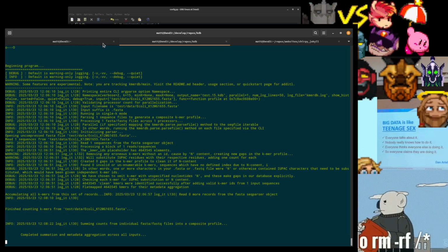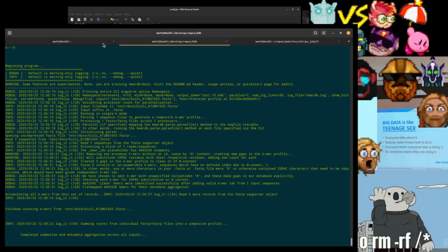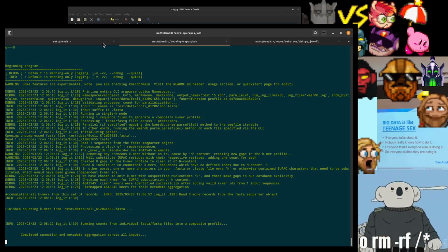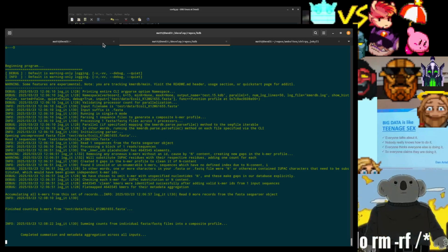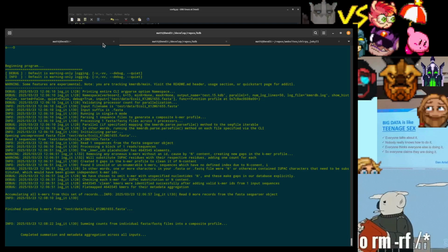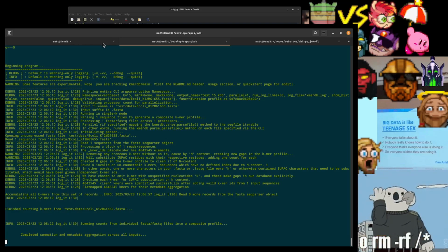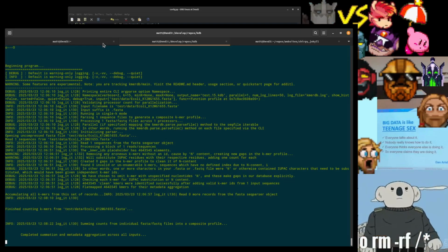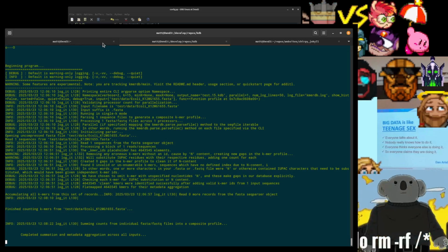It treats N residues as ambiguous and essentially creates gaps in the k-mer profiles, which is sensible behavior. So if a k-mer has an N in it, it doesn't get a k-mer ID and it doesn't get included as any count. Doublet or triplet residues, if you have ambiguity in your sequences, it will count them as both. That seems to be a sensible solution as well. It's not great. But this is fundamentally just k-mer counting. It has nothing to do with graph assembly and other stuff.